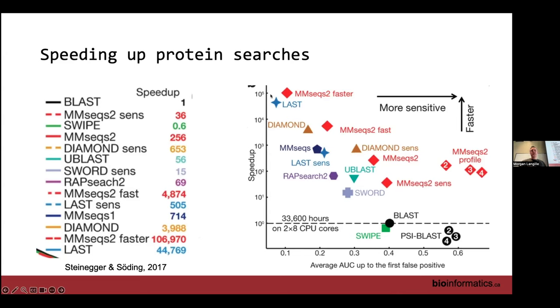PFAM is more focused on protein domains. They do have full length genes, but really they focus on domains of proteins. If you've ever done a BLAST search or anything basic like that, often you'll get BLAST hits plus you can find a domain, which is just a chunk of a gene, a smaller piece. Obviously PFAMs or domains can be shared a lot more across different types of genes. So if you have a common protein domain, it doesn't necessarily mean that your proteins are doing the same thing. It just means that they may have some aspect to it that's similar. So with a zinc finger domain, for example, you're thinking, oh, maybe it binds to DNA.